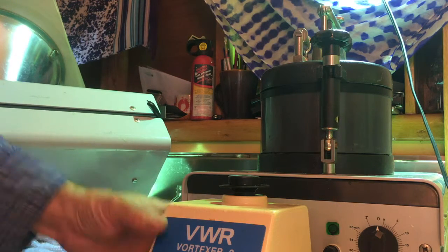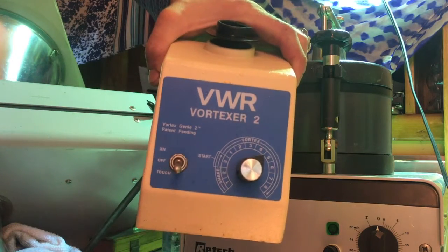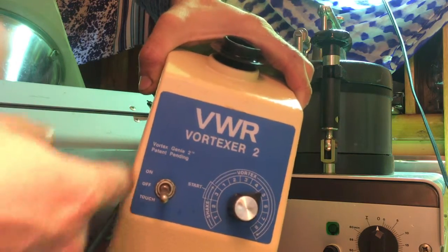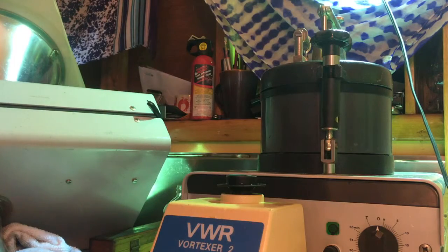Vortexer demo — here it is, the VWR Vortexer 2 with the speed control. It's got the touch activation, so it just turns on when you touch it, off when you touch it, or you can leave it on all the time.